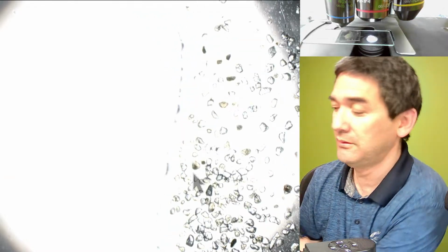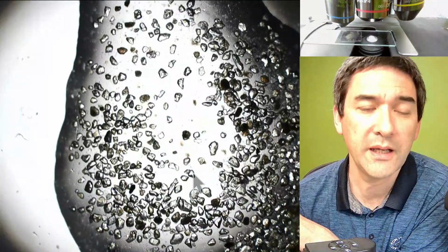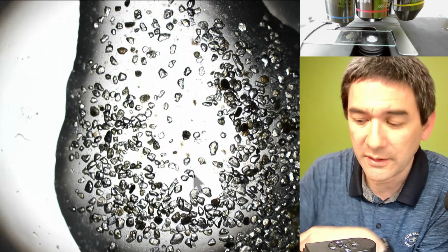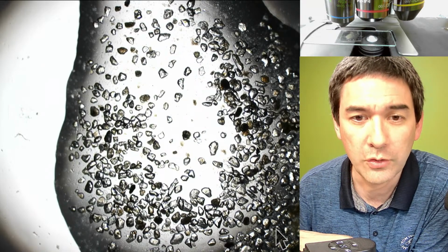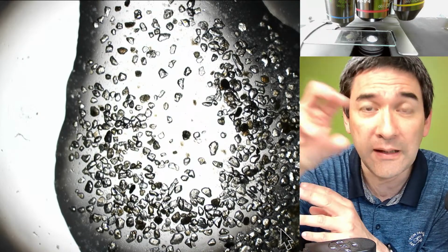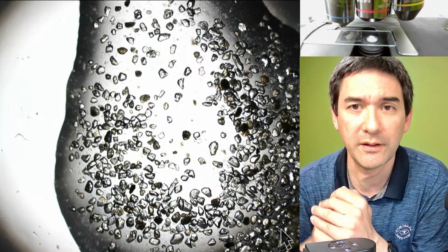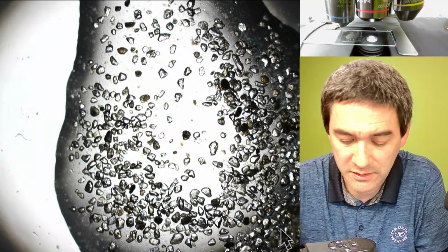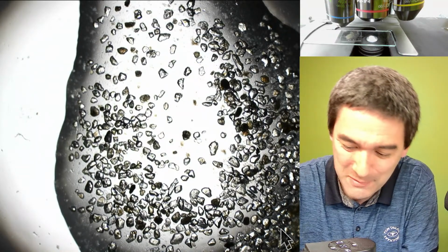Then you get the idea, okay? I keep on doing that. I dilute it with water. I keep on doing that until, for example, I get only the animal, the tardigrade, that I want to have. And I usually do that when I make YouTube videos, where I just want to have the organism completely isolated and nothing that disturbs it around it. So that's kind of the idea of doing it like that. That's also something that I essentially did not plan on showing you, but maybe it proves to be interesting to you.